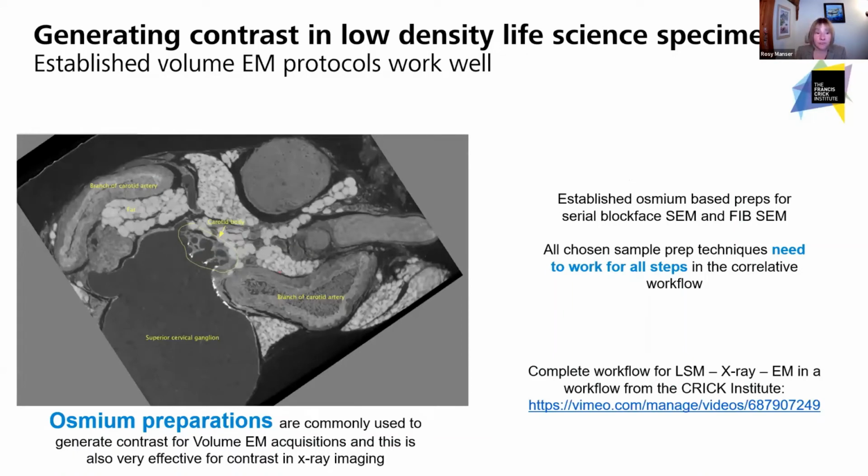Equally, if you're looking at being able to combine different protocols together, the volume EM community has a few very established protocols for preparing their specimens, and some of these work really well with X-ray imaging too. So this osmium prep that's commonly used for serial block face SEM also works really well for X-ray imaging. And what you can see here is an example taken from the Crick.